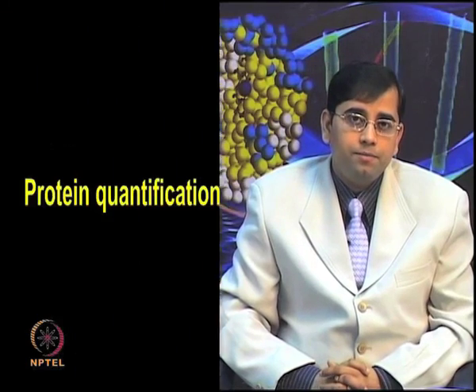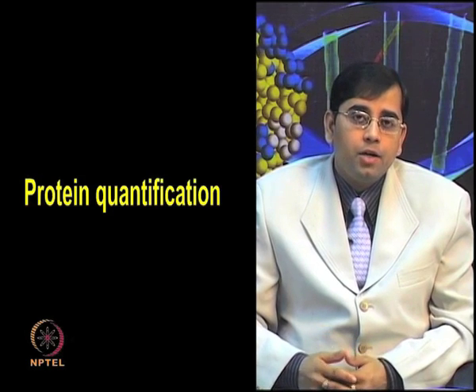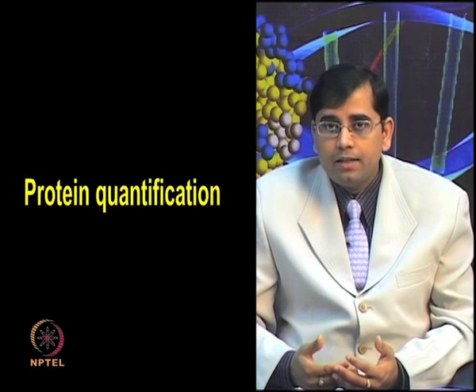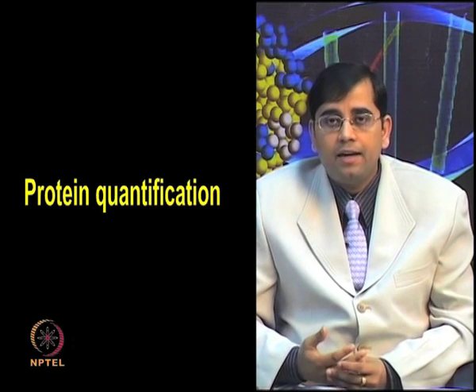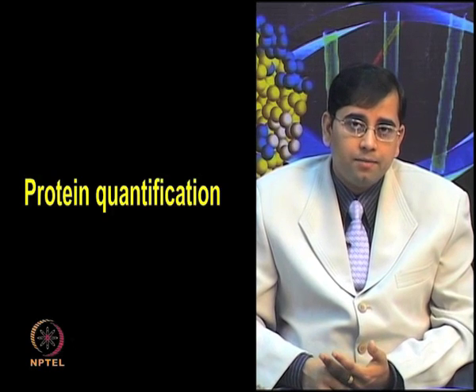So, now let us move on to the next topic, which is protein quantification. By now you have prepared your protein sample using different types of methods, keeping a very careful eye on different types of interfering substances and contaminants, and you try to eliminate all of those components.